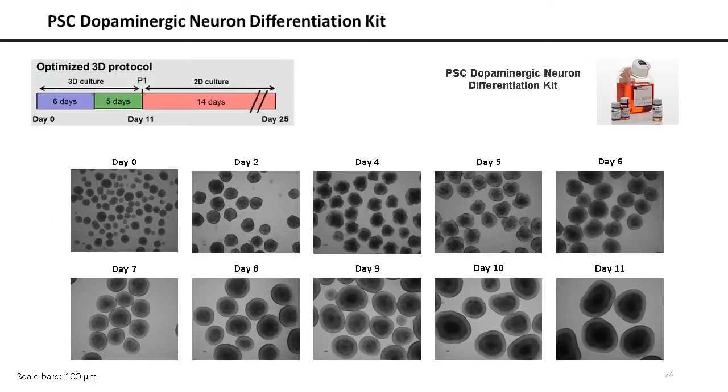And a curious thing is that during the induction for floor plate progenitors, we also experience some membrane blebbing, like in the first days, but by day 6 and 7, we also have the structures that we observed with the NIM, but instead of the cells starting to divide into smaller aggregates, they remain in the original aggregates as more denser centers.